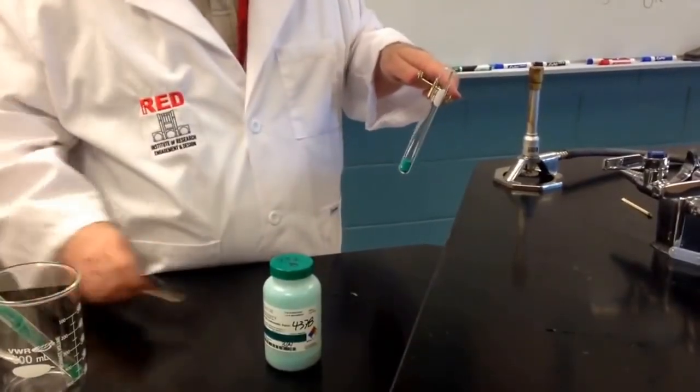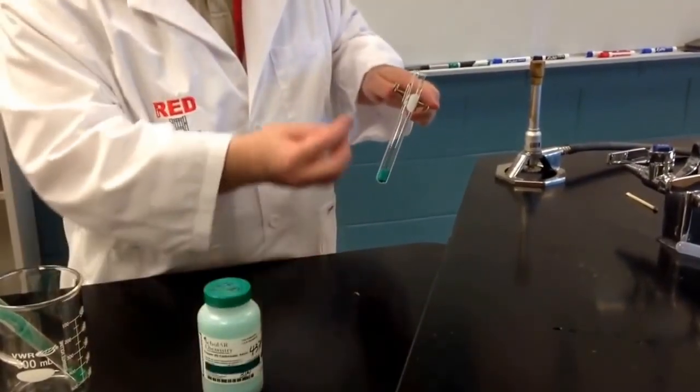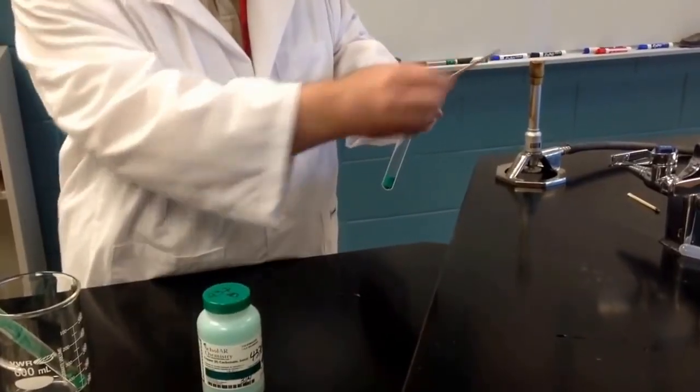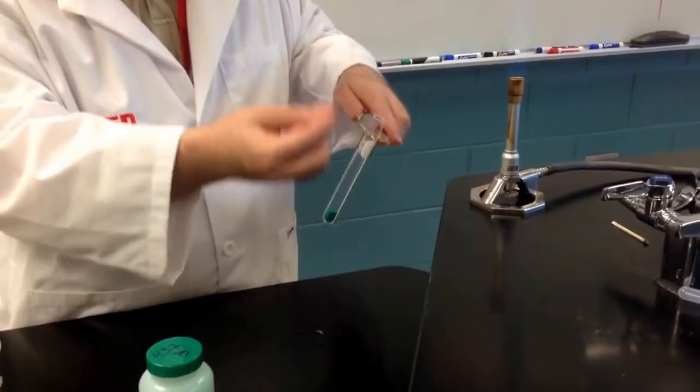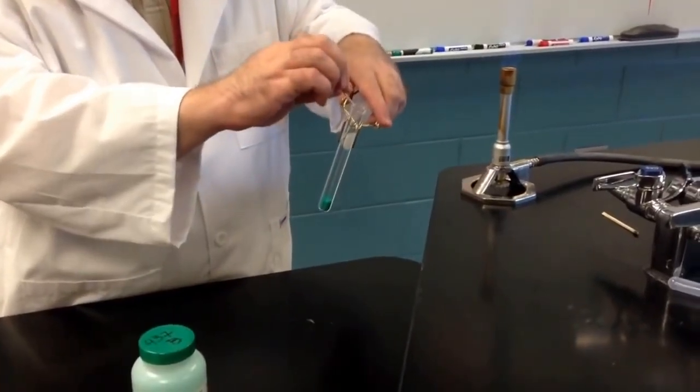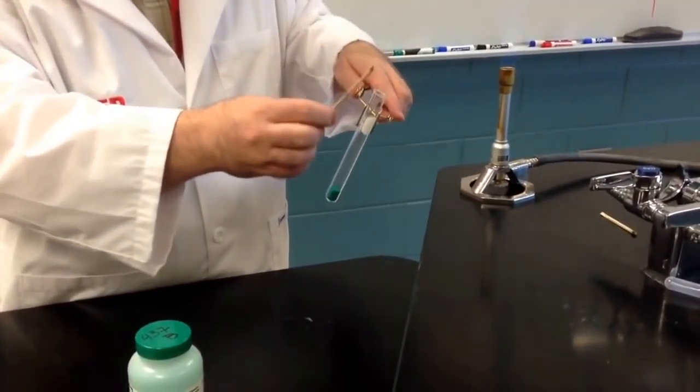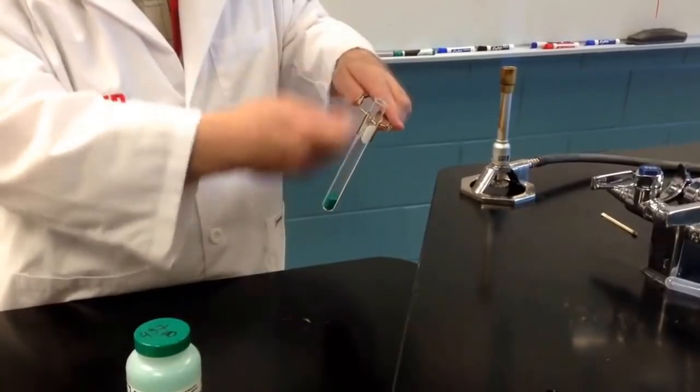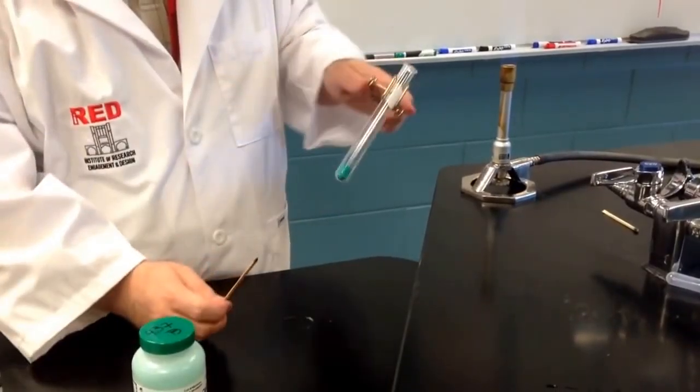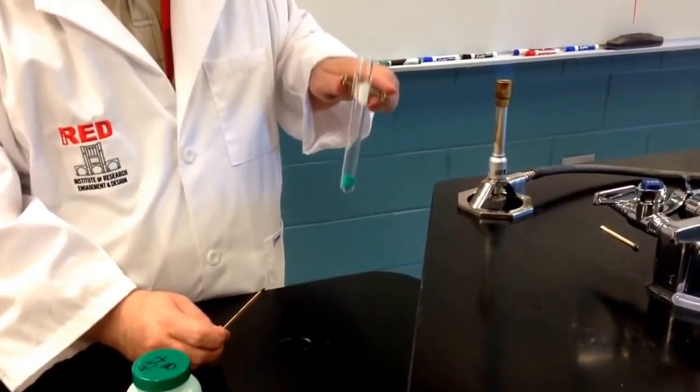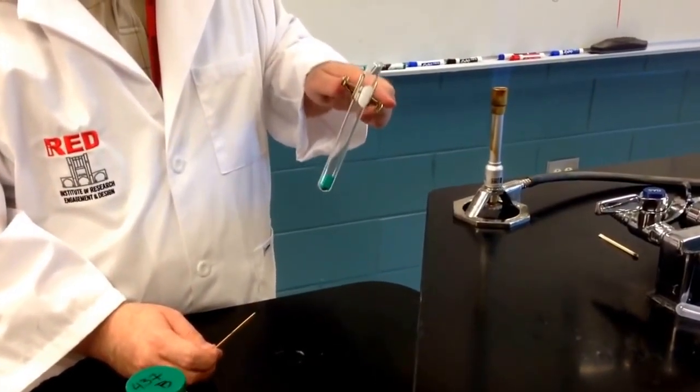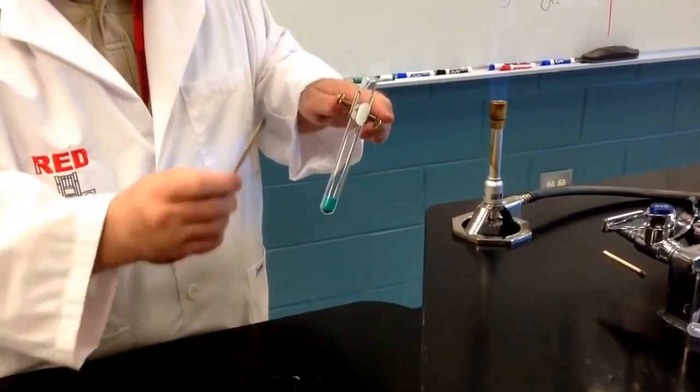And we're going to test for the presence of carbon dioxide by taking a splint, light the splint in the flame, hold the lit splint over the mouth of the test tube, and if this lit splint goes out, that will indicate to us that indeed carbon dioxide is being released during this reaction. Again, this is an example of decomposition of copper 2 carbonate, and it's going to form copper 2 oxide and carbon dioxide.